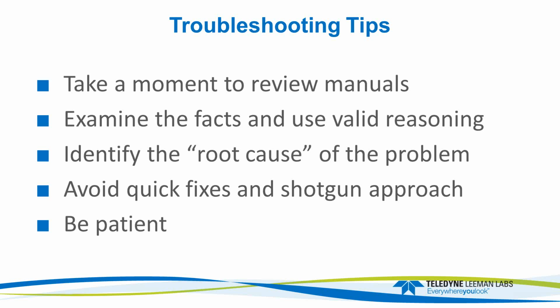And finally, be patient. Some problems, and we'll see that in the common problem section, are pretty easy to figure out by just a little bit of inspection. You look at something and you can tell it's not quite right. Some of them take a little bit longer. Some problems are subtle, particularly if they're intermittent problems. They don't happen all the time. And some of the diagnostic tests will be able to shed light on some of those intermittent problems that you may run across.